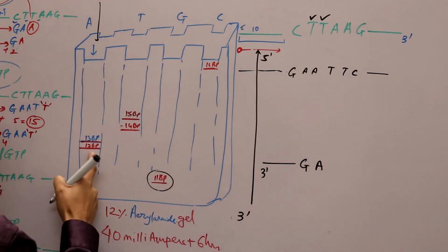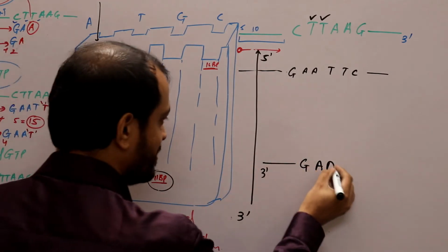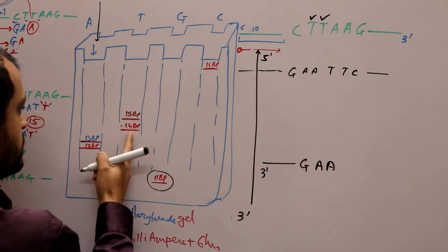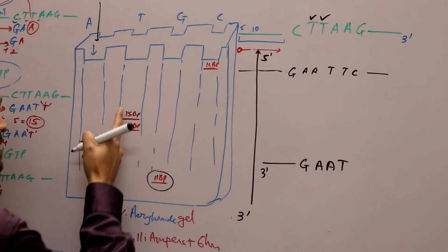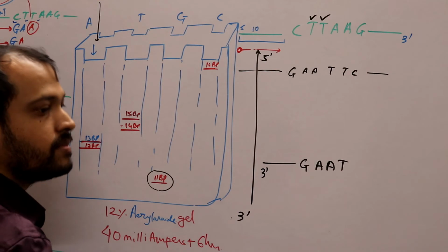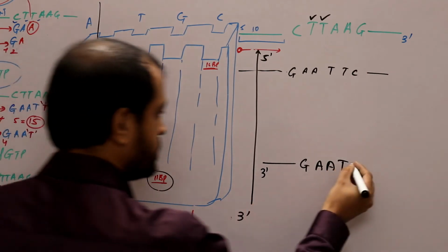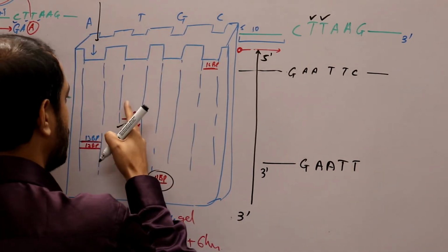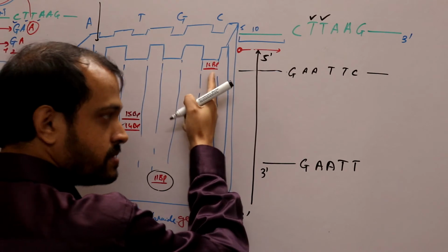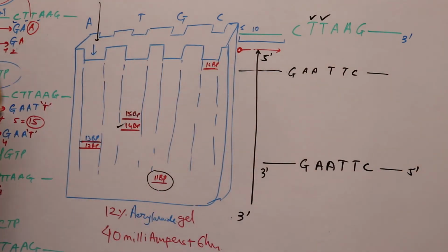Okay? Then, lowermost after 12, 13, again A. Lowermost after 13, 14, T. Lowermost after 14, sorry, higher with respect to 14, 15, that means again T. Again, after 15 what comes? This 5 prime. You have got this sequence, right?